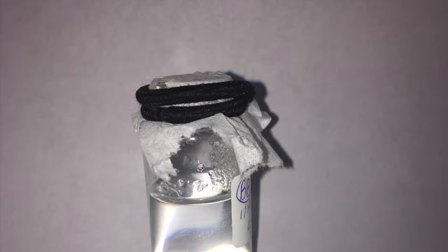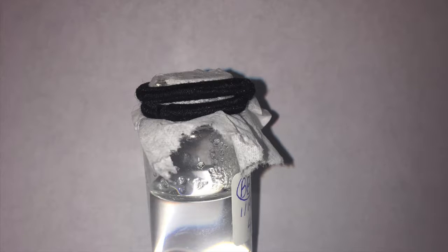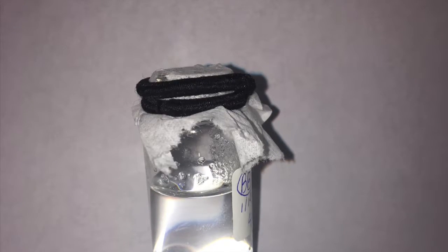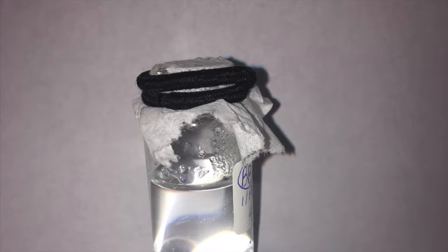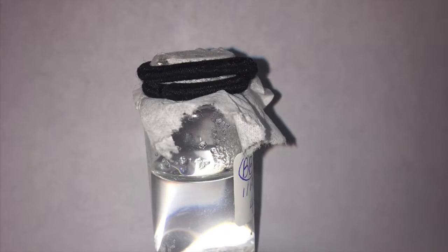Today is February 19th, and my crystals have developed. They appear to be forming a sort of crust along the bottom of the vial. There are 3 main clumps of the crystals, with 3 individual crystals scattered around the bottom. The majority of the crystals are 2 to 3 millimeters in diameter and about 2 to 3 millimeters in height.